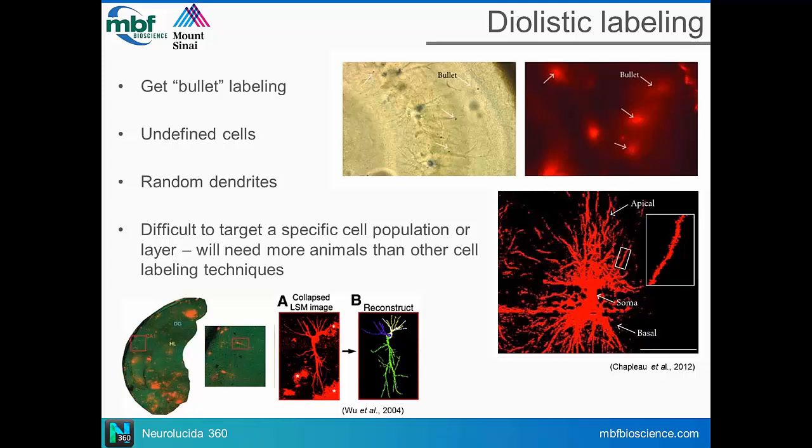And this is just at the tissue prep stage, and then you've got to carry all of those steps all the way through to analysis. Yes. So it's not a quick technique, but that's true for any of these techniques, right? It's not specific to diolistics. No, that applies across the board, whether you're doing cell loading, filling of recorded neurons, or GFP neurons.